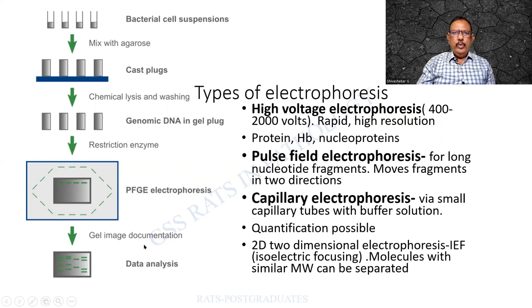But ultimately, you do get an image that is fed onto a computer. The data is analyzed and stored. It is not possible for any of the microbiologists or a pathologist to be running behind it, going to the field and seeing. Therefore, this is one great advantage. And if you go to my class on telemedicine, probably if I do not understand it, I can send it to you for advice.